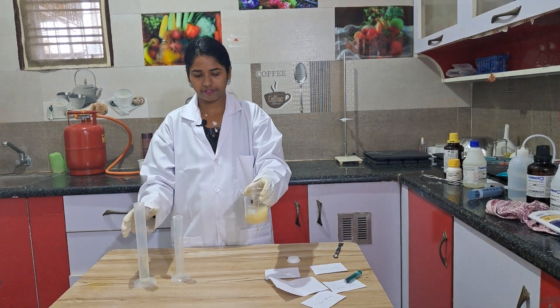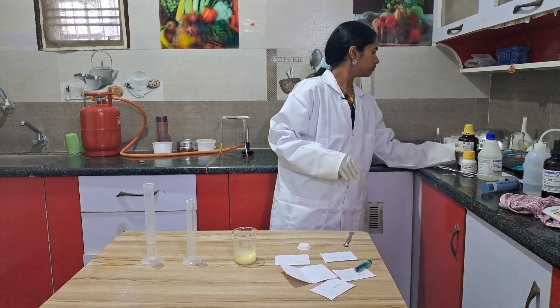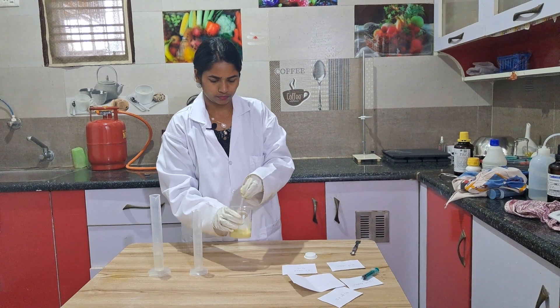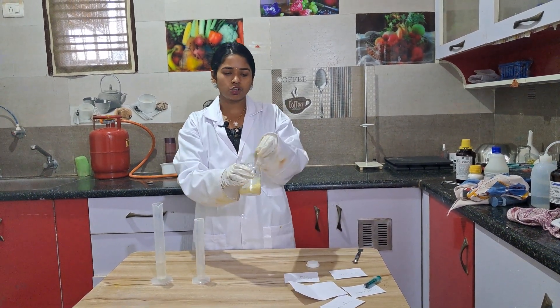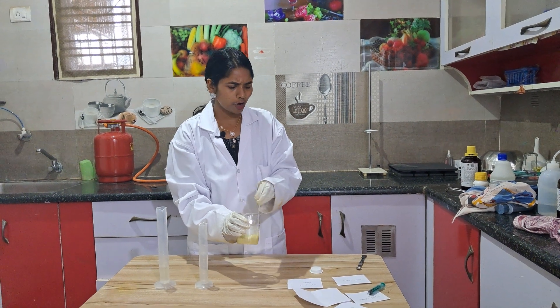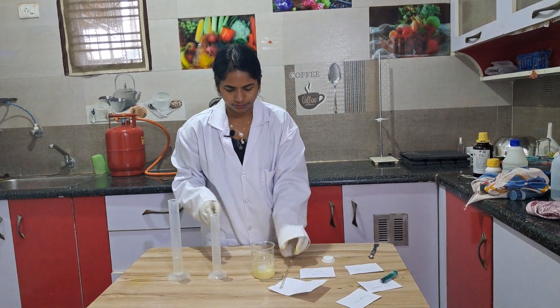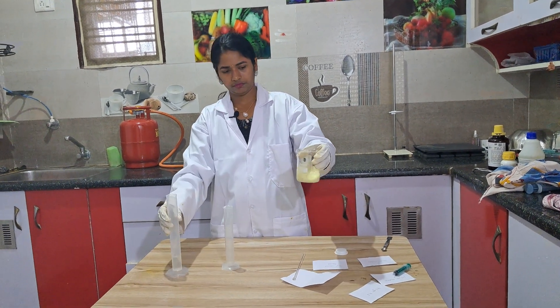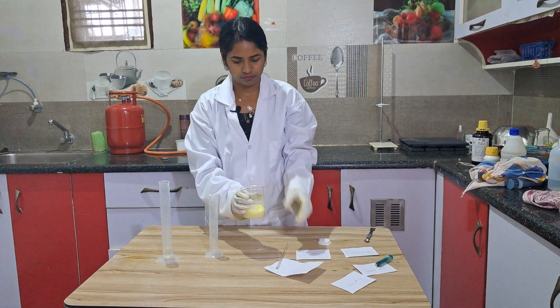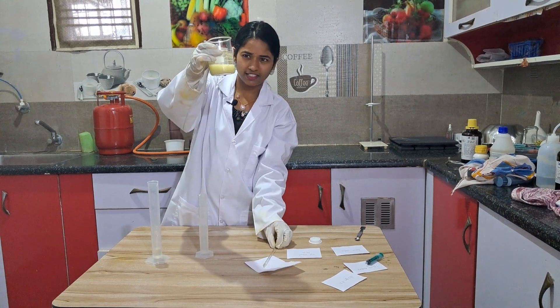Add the entire solution drop by drop and shake well. I am using a glass rod and stirring the solution. You can use a glass rod or normally stir the solution — it is not necessary that you use a glass rod.